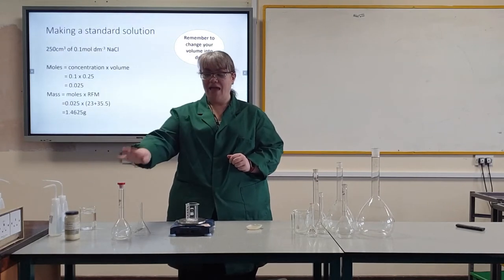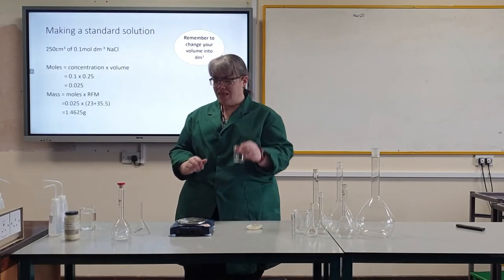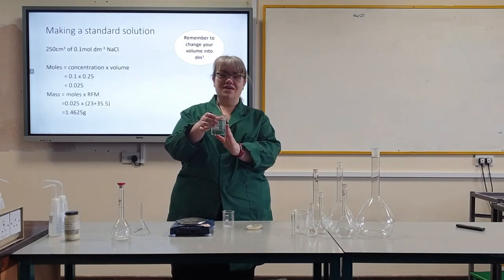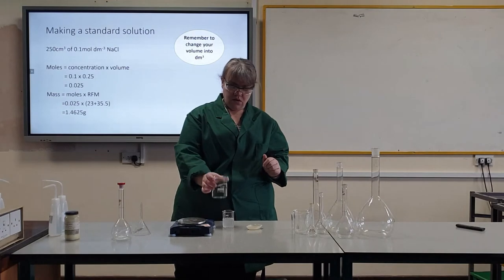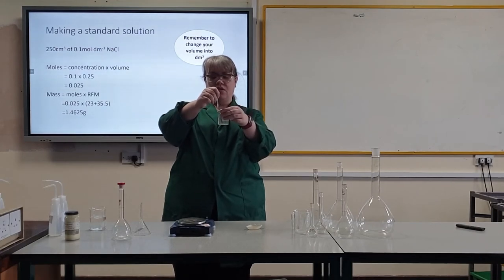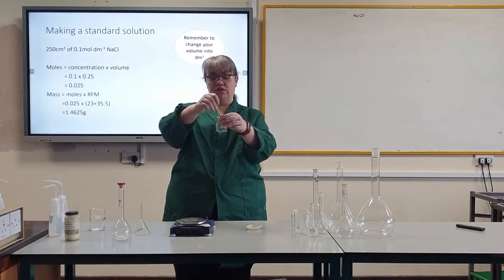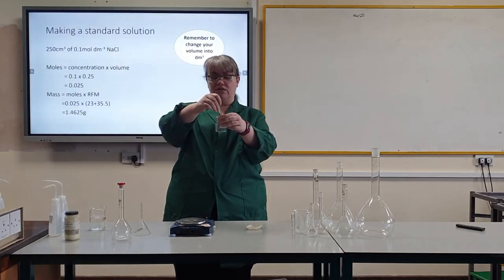I will use that mass to calculate the actual concentration of my solution at the end. Now I can put some distilled water in — I have decanted some distilled water into a beaker to make it easier to pour — and I will stir to start dissolving that solid. If you have a compound that doesn't readily dissolve in room temperature water, you can use a warm water bath to help that solid to dissolve.